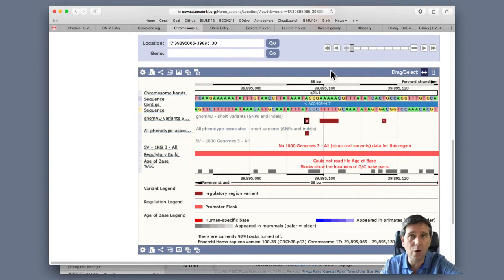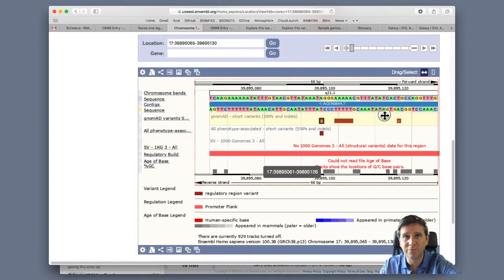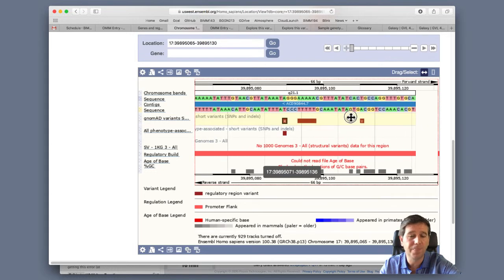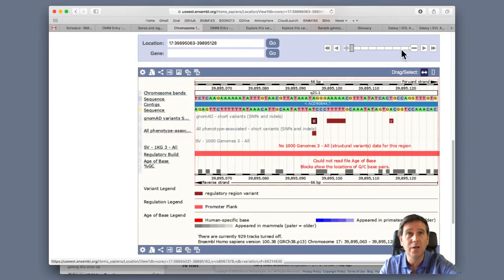So when I'm zoomed in all the way here, I actually have a view of the nucleotides. There's the forward strand, there's the reverse strand. Remember what we had for this allele? There it is. Here's the SNP, the variant. So this is this location, and there's our region. Okay, so we could zoom out and we can move along. You can, to some extent, go along the strands here and navigate and see where those genes are. Let me zoom out again a little bit.